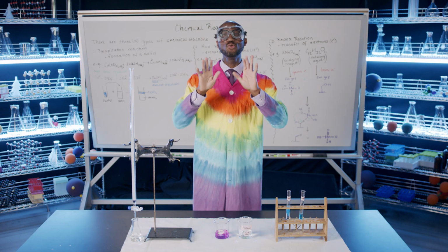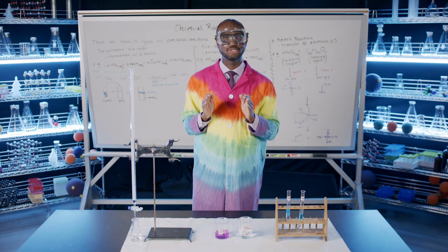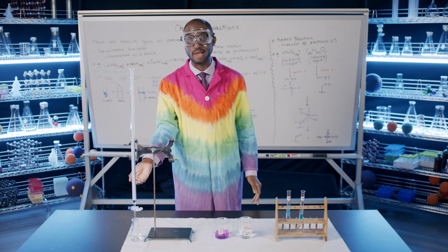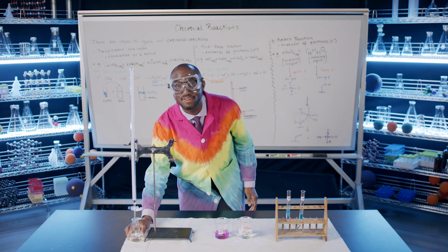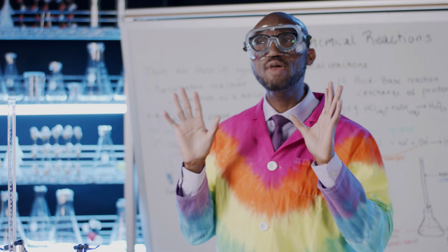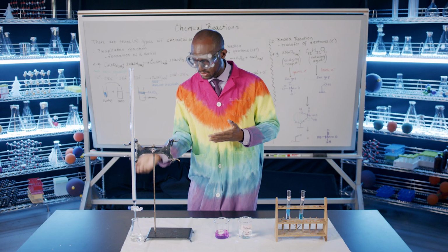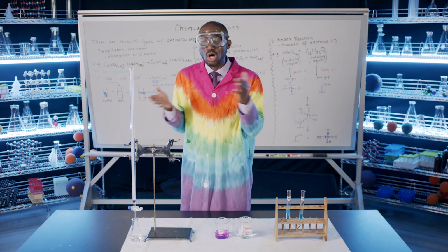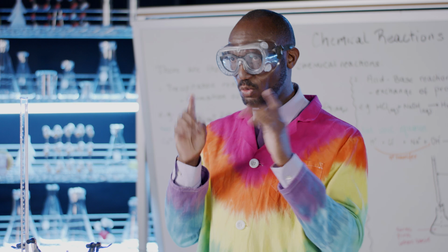We're going to bring out the cool equipment. You're not a real chemist unless you've done a titration. And what we're going to do is we're going to use this burette to add some sodium hydroxide bit by bit to the acid that we have here in the Erlenmeyer flask. But wait, hold on. Both HCl and sodium hydroxide are colorless solutions, you can see here. Water, the product of the reaction, is also colorless. How do I know that they've reacted? Well, we have a trick.